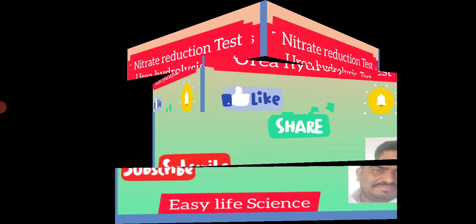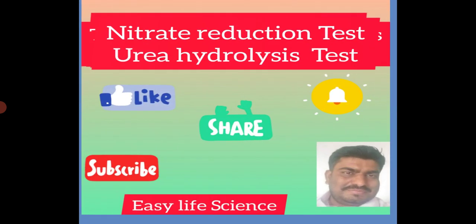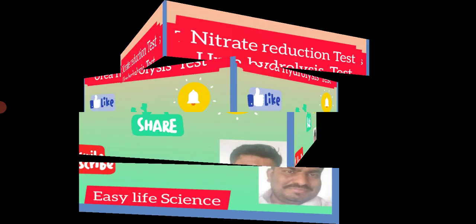Here I am talking about a practical nitrate reduction test and urea hydrolysis test.